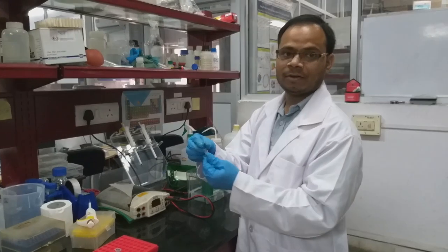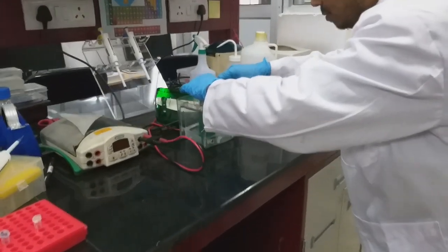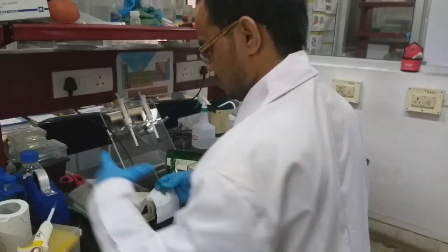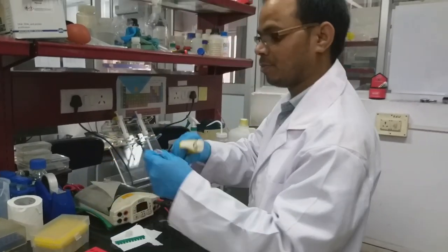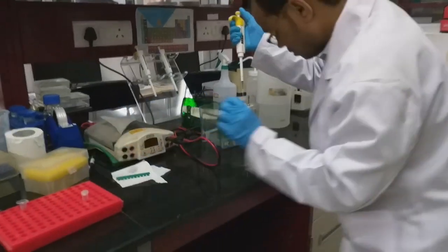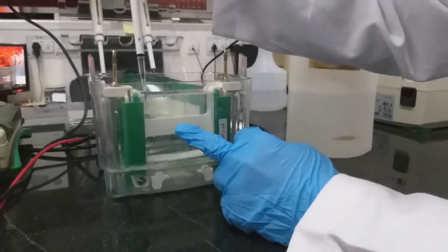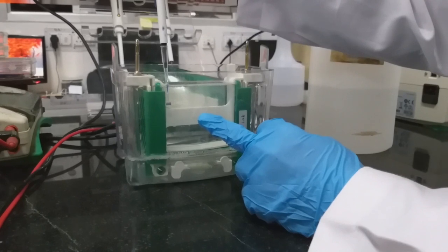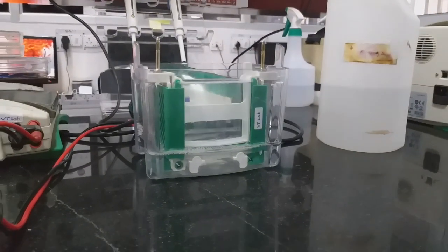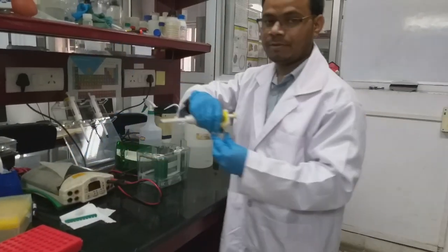The protein samples are ready. We heated them sufficient time. Now we have to load this. So we have to remove the comb carefully. Then first I am going to load the marker, the protein ladder. Next, load the sample.